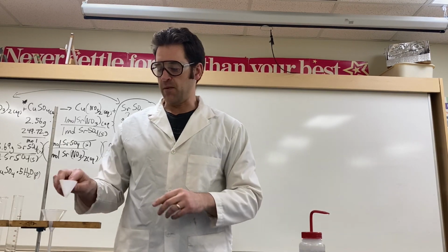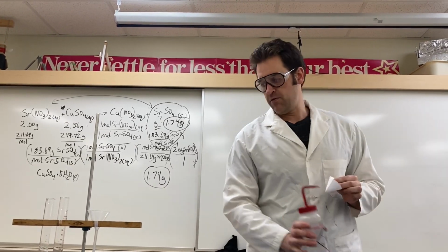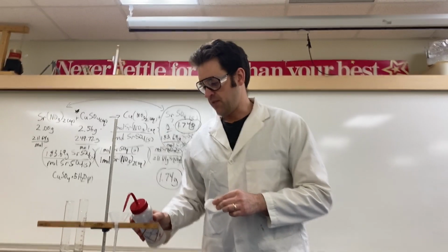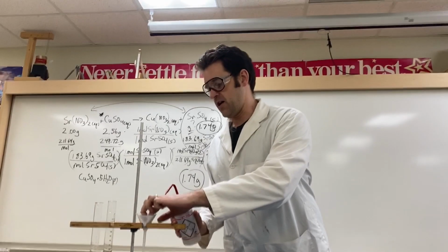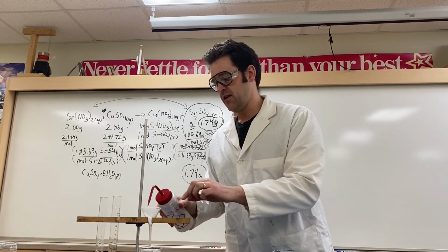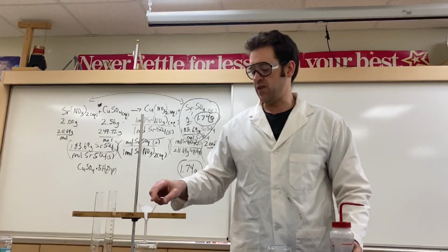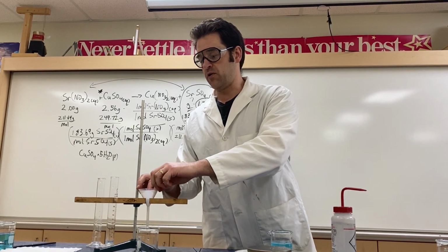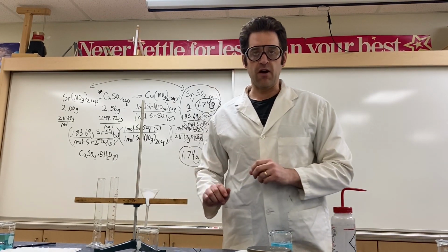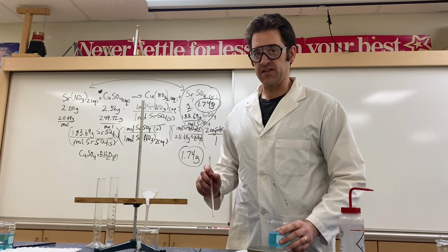Now this, if you try and put this in the funnel dry, it sometimes just shoots right back out. So what I like to do is give a little squirt and wet down the funnel, and you maybe have to get the whole thing a little wet so it's sticky, because you don't want it to be lifting, because you might pour the chemical through a crack, and then you're not going to capture stuff. Okay, so this is the awesome solution that the Z-dawg got ready.